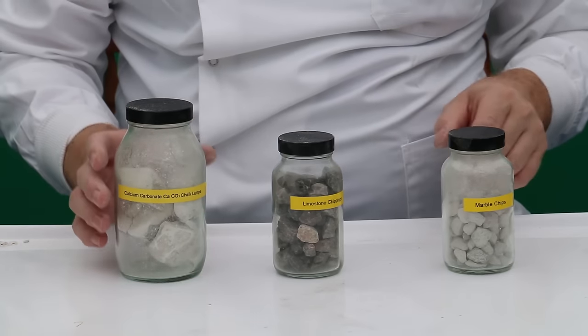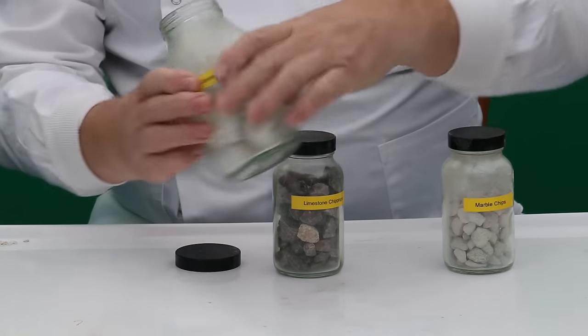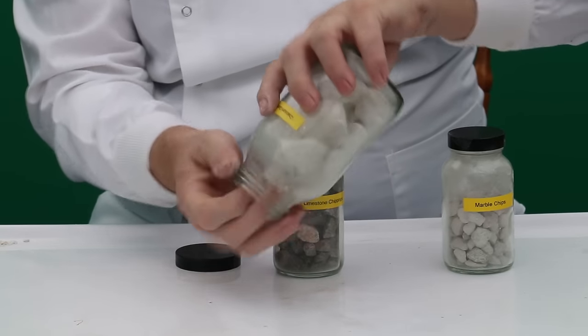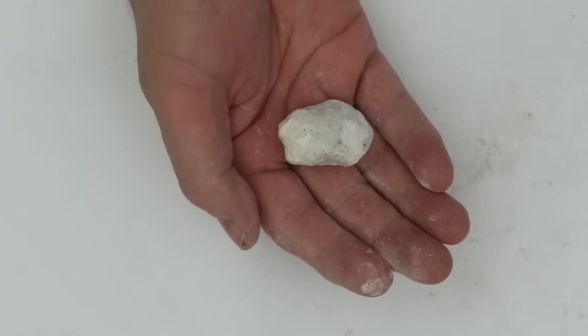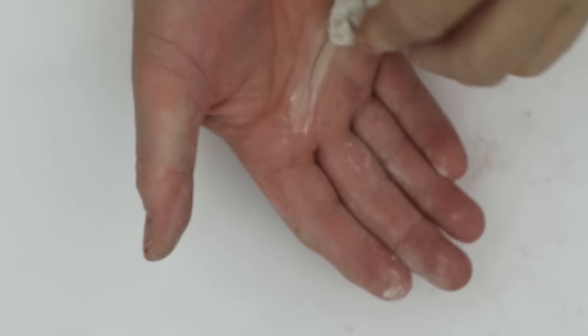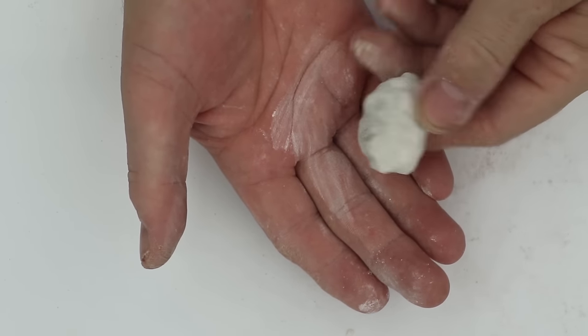Let's have a look at some of these substances. Here we have some chalk, some little pieces, and that's a slightly bigger piece of chalk. It's a white crumbly sort of material.